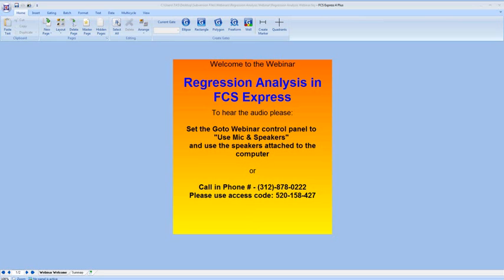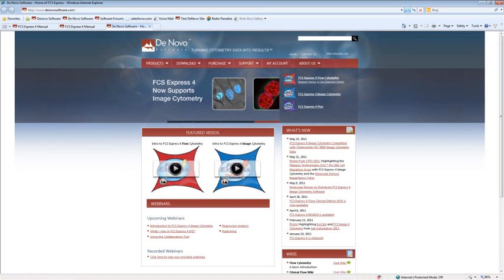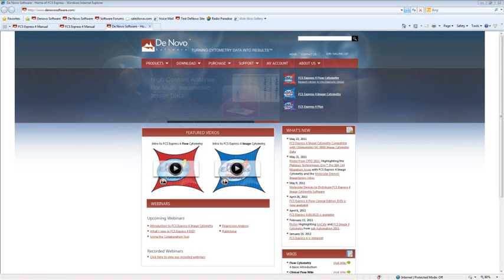And we have many resources and in-depth explanations for regression analysis in our manual and in our tutorials. And I just want to bring up our web page here real fast, which I have on my other screen. Here's our home page, and I just wanted to show you where these resources are before we start.